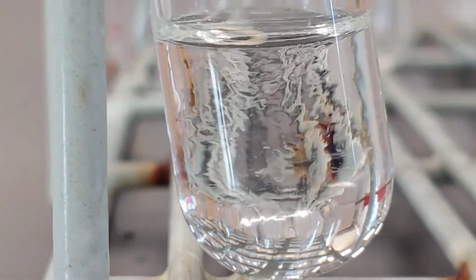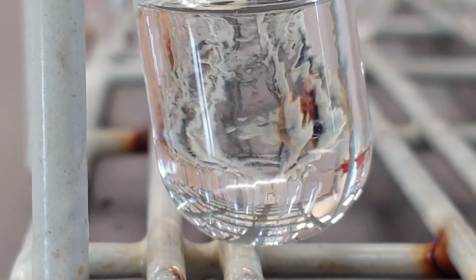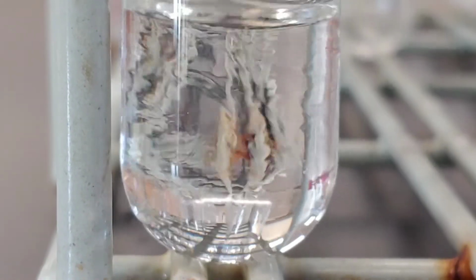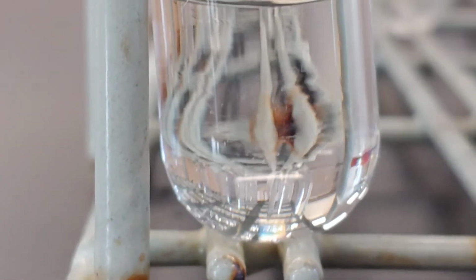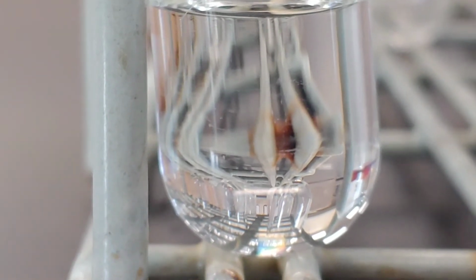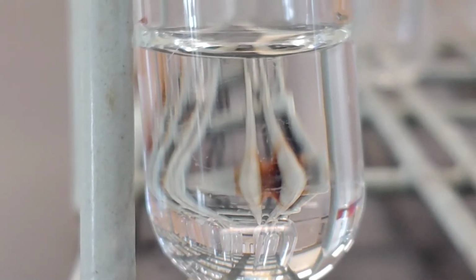The other thing I could tell you is that the test tube is warm, that this reaction is releasing heat in the process. Mix that up. Okay, there we go. Sodium hydroxide plus hydrogen chloride, hydrochloric acid. That was reaction number 9.